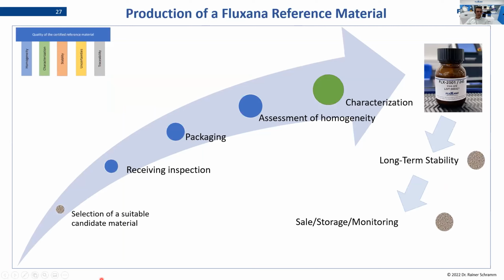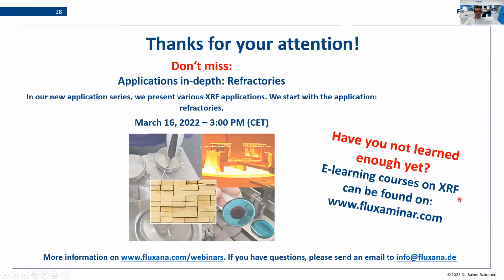And here is the whole process that I have shown you. It starts with selecting a material. Of course, there it can already be a long story, where you send material back and forth to find out, is it really suitable? And then we have to make sure on our side that the material is really fit for purpose.